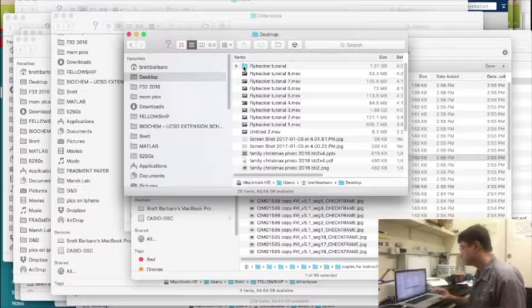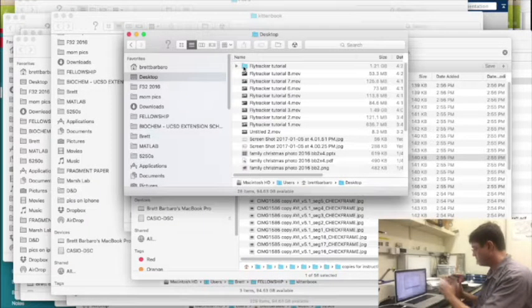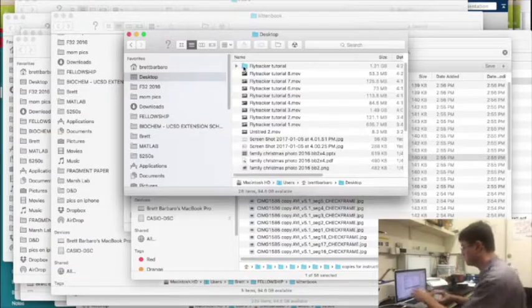Now this is actually very interesting. If I have multiple videos in that folder, Flytracker will actually analyze all of them and output the results into that folder. And that can be very useful in cases such as when I am trying to compare 20 different vials and I have to do them in batches of 6. So I can make 4 different videos, with all of those files in them, and then take those 4 videos and put them into a single folder and have Flytracker run on that folder.